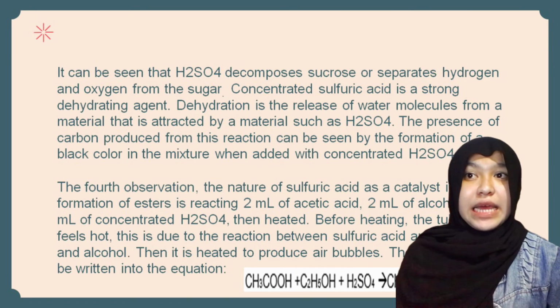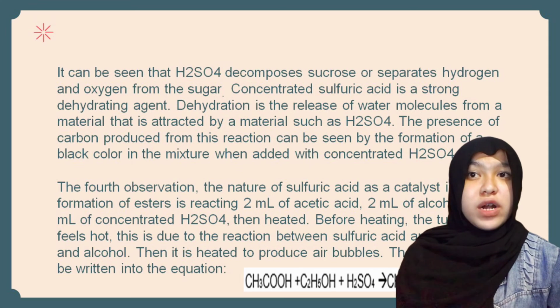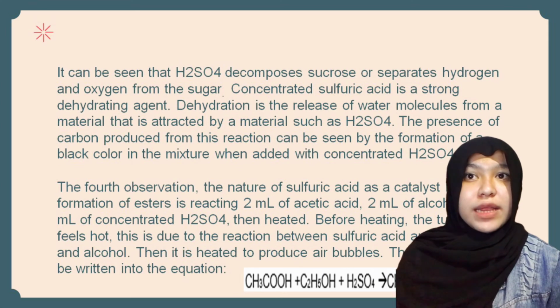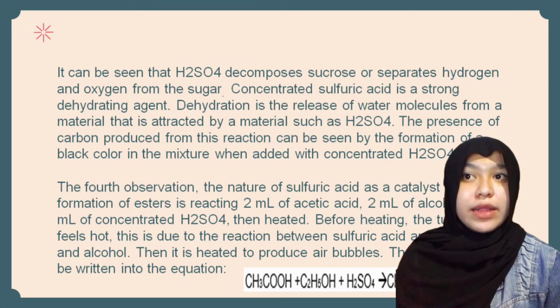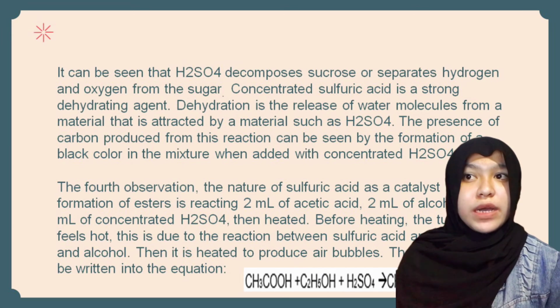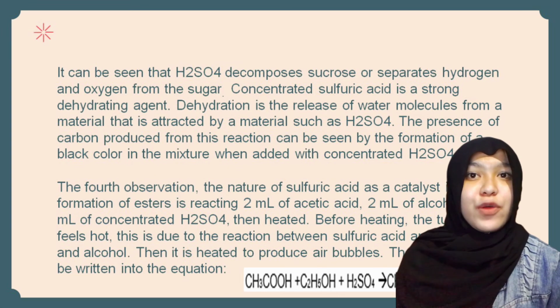It can be seen that H2SO4 decomposes sucrose, or separates hydrogen and oxygen from the sugar. Concentrated sulfuric acid is a strong dehydrating agent. Dehydrating is the release of water molecules from a material, attracted by a substance such as H2SO4.